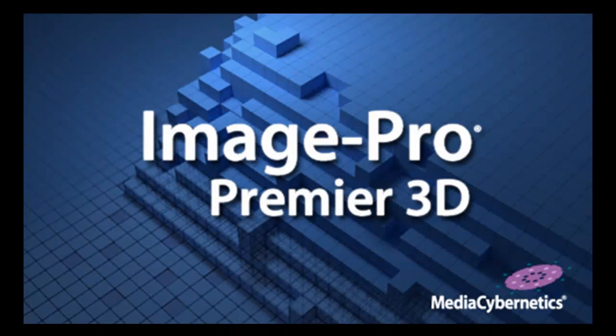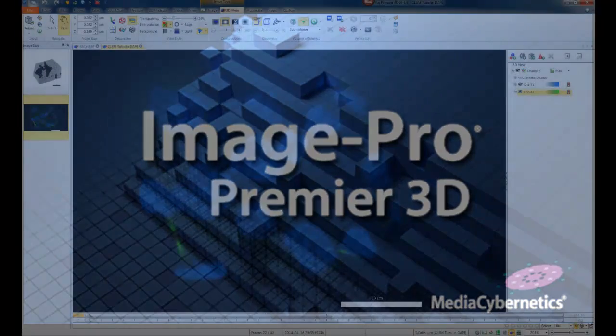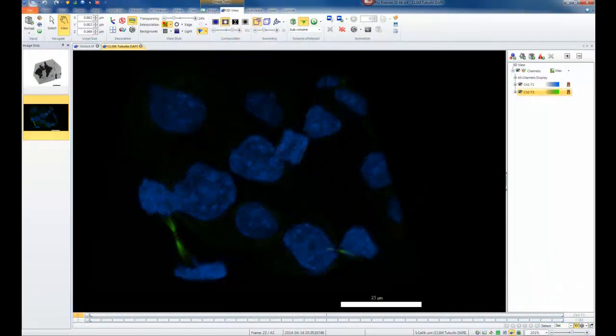Introducing Image Pro Premier 3D, the future of image analysis. Let's take a look at some of the benefits this powerful platform can deliver.